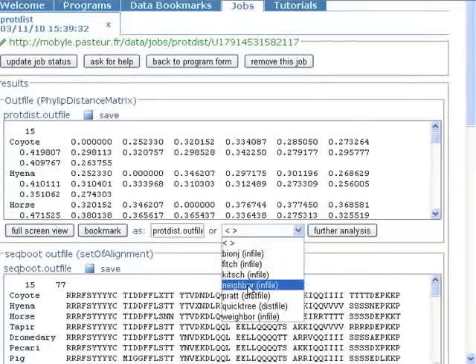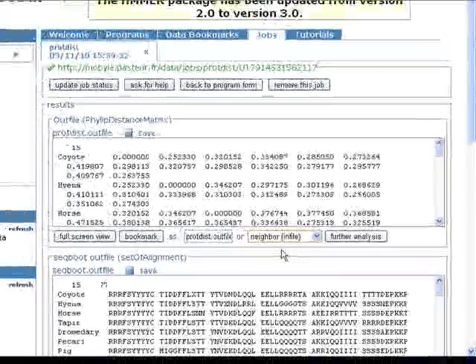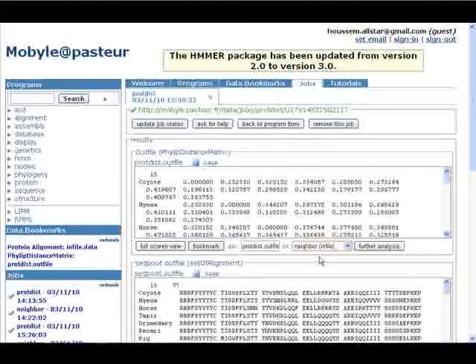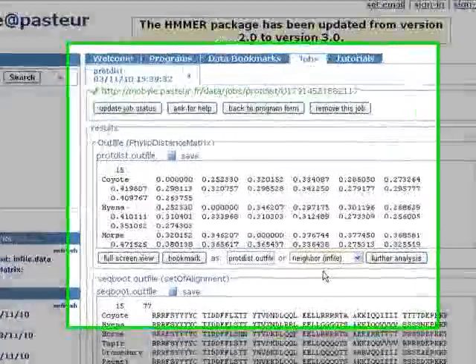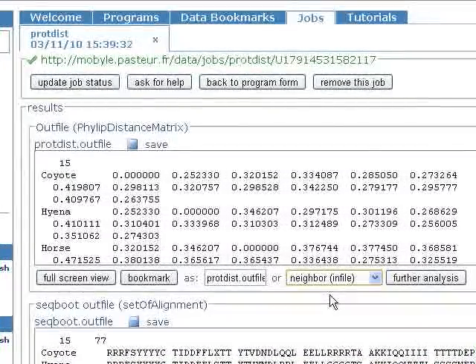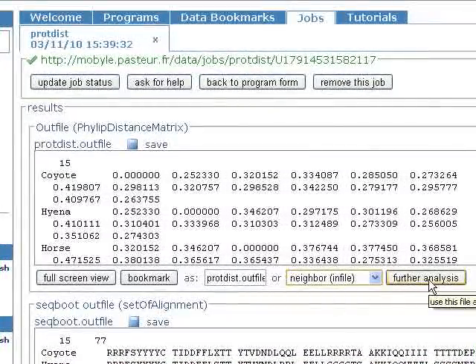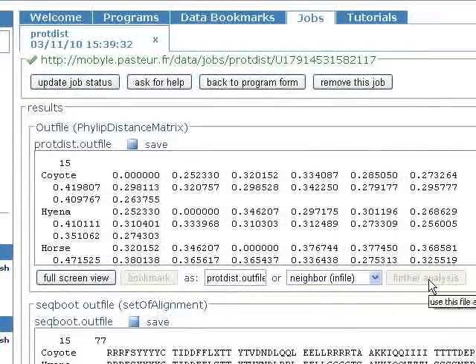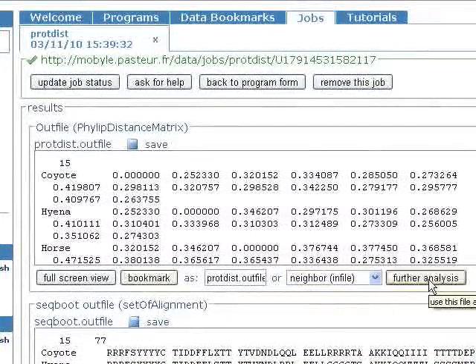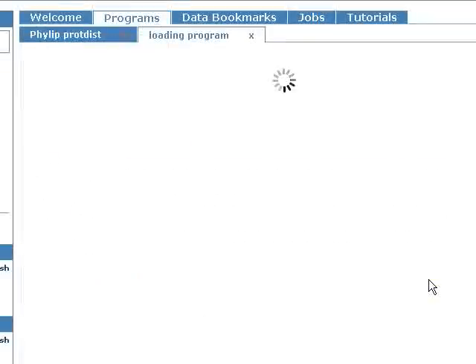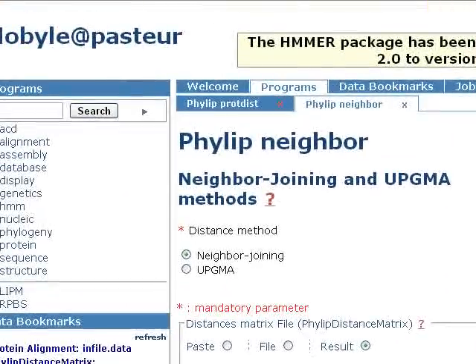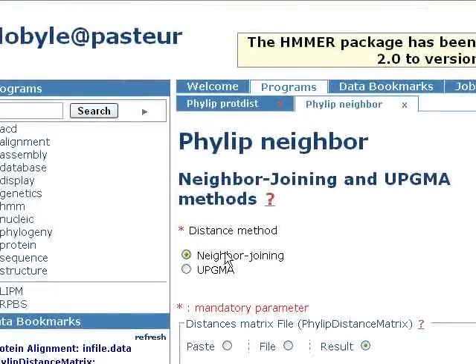Here we will choose neighbor joining. I prefer to choose the neighbor joining method because I find it the most accurate one. Then we click on further analysis and wait a little. Here our distance method is neighbor joining.